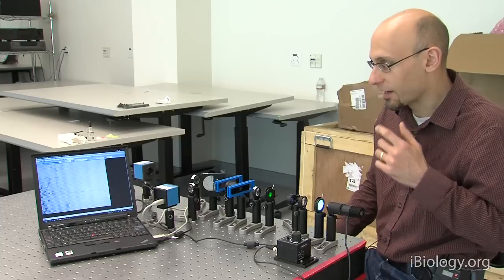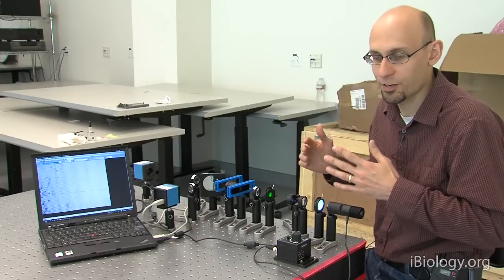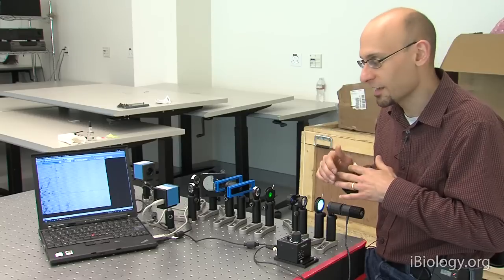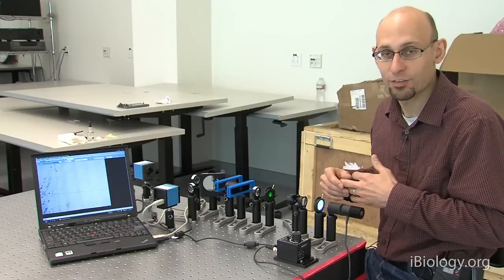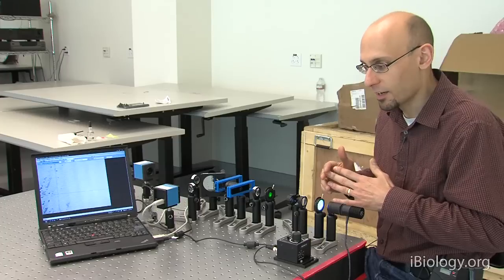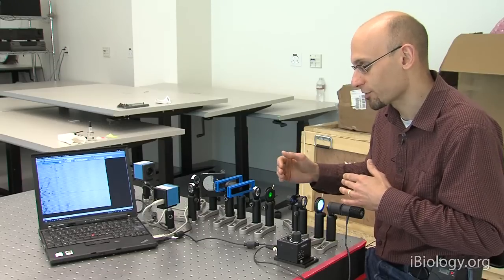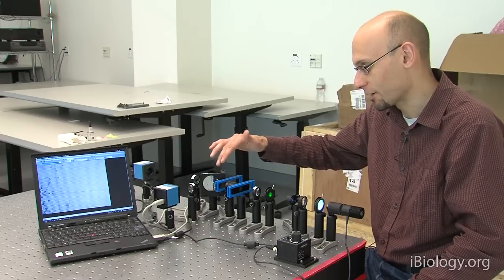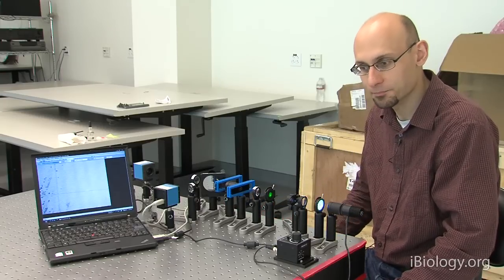So hopefully I've convinced you now that the back focal plane of your microscope not only encodes all the information about spatial structures in your sample by their spatial frequency, but it's also a complete representation of that information. And blocking information there prevents you from retrieving that information in your final image. So the back focal plane is the Fourier transform of your sample, not just mathematically, but physically. And that's how the information gets reconstructed by your microscope. So essentially in a microscope, your objective lens generates a Fourier transform of your sample at its back focal plane, and your tube lens then resynthesizes that Fourier transform into a real image on your camera.